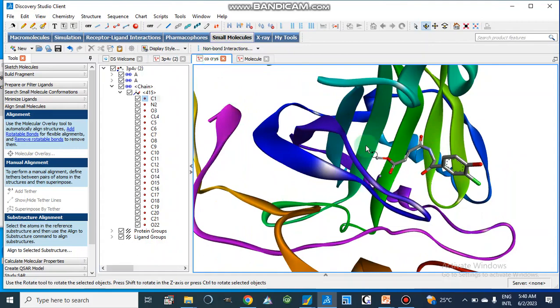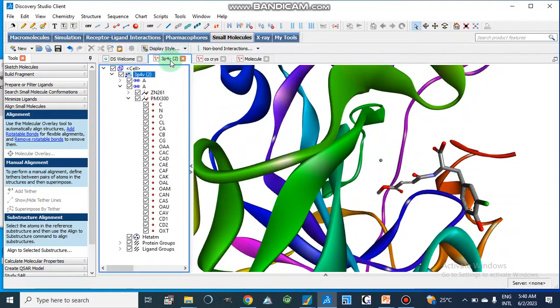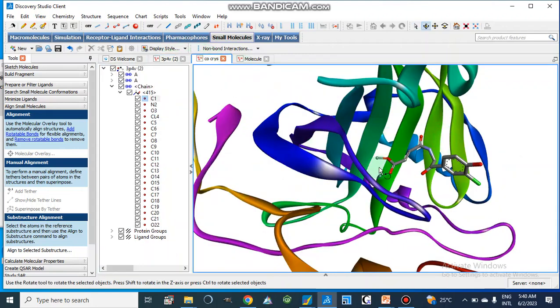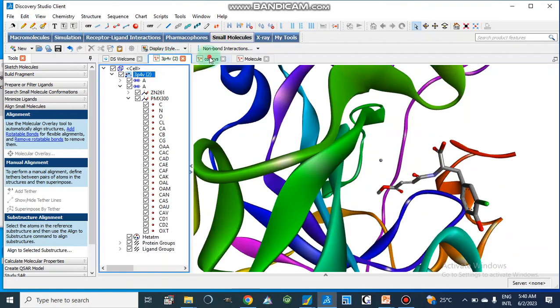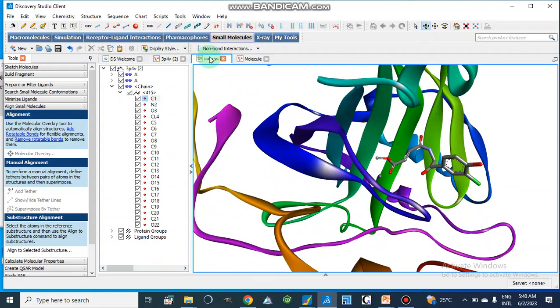Now here I am going to show you our saved file after docking. This file is the co-crystallized ligand file, and this other file is our ligand after docking — it is the docking pose of the same ligand which is co-crystallized inside this active site.